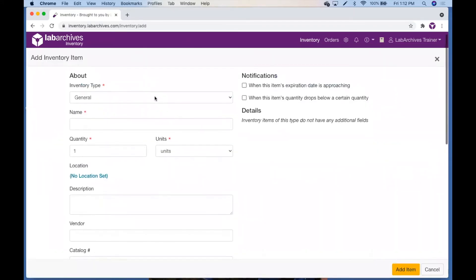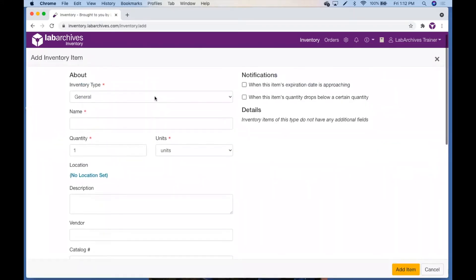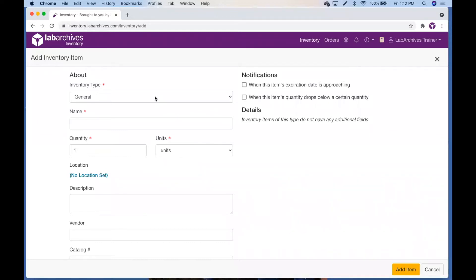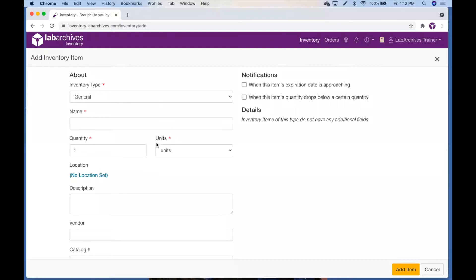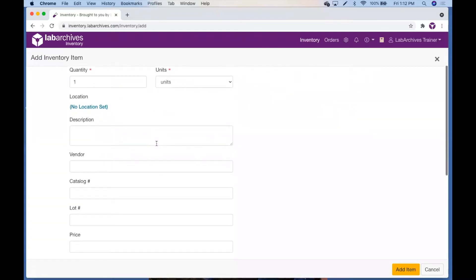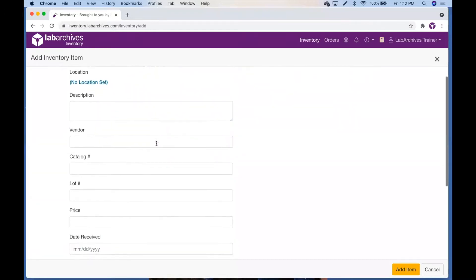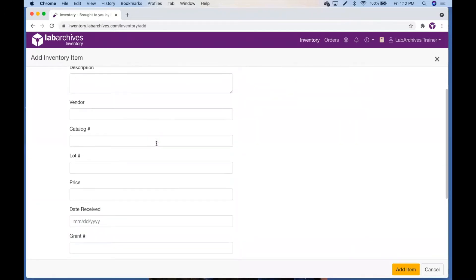We recommend specifying an inventory type first. The inventory type selected will determine which fields are available to fill out. Notice by default the general type will only show standard fields such as name, quantity, catalog number, lot number, and expiration.